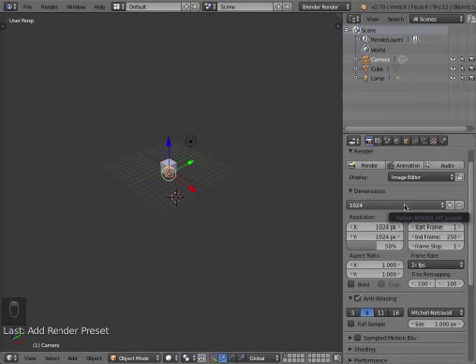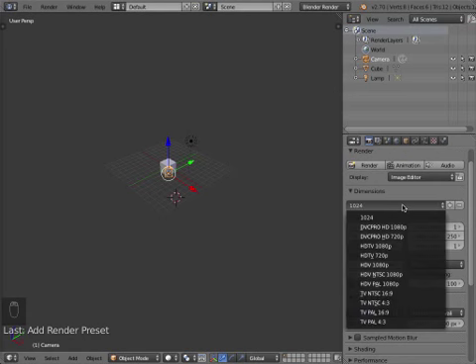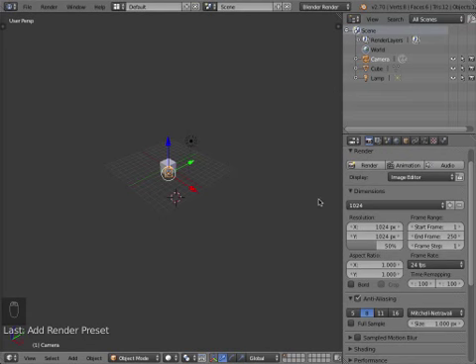Unless you're actually doing rendering for specific screens. So you might be rendering for HDTV, so that's 1080p or 720p or whatever, because that's a projector or whatever device you'd be working with. But for our purpose, mostly 1024 by 1024 or 1024 by 2048.